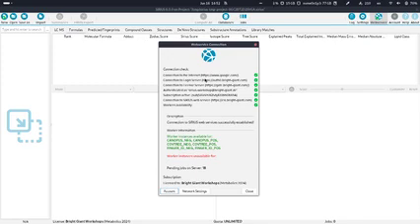Usually if you open this tab and you see you have some red crosses, you should check if everything is working. I think it's not happening very often, but sometimes it might be that the SIRIUS servers are down, in which case you would also see it here. Yeah, but here it looks very good. You can see here in the middle, worker instances are available for, and then you have all the services, and there are no worker instances unavailable for anything. So this looks very good.